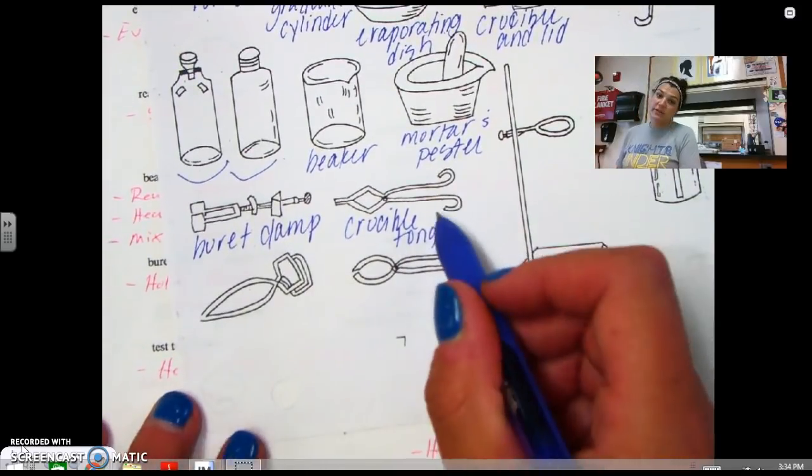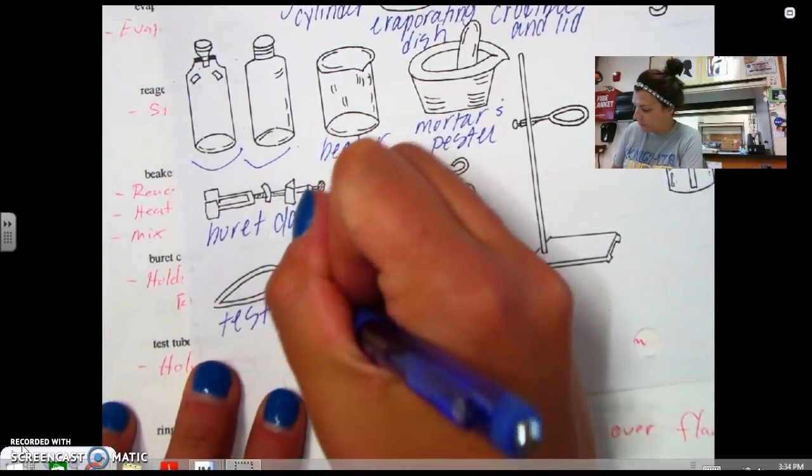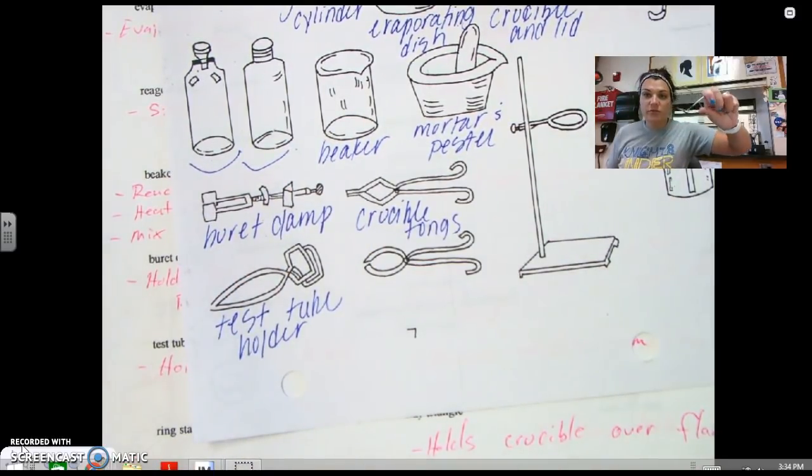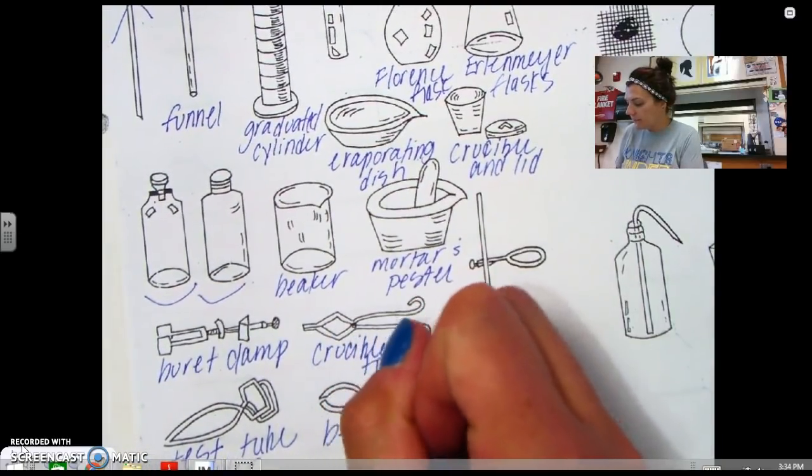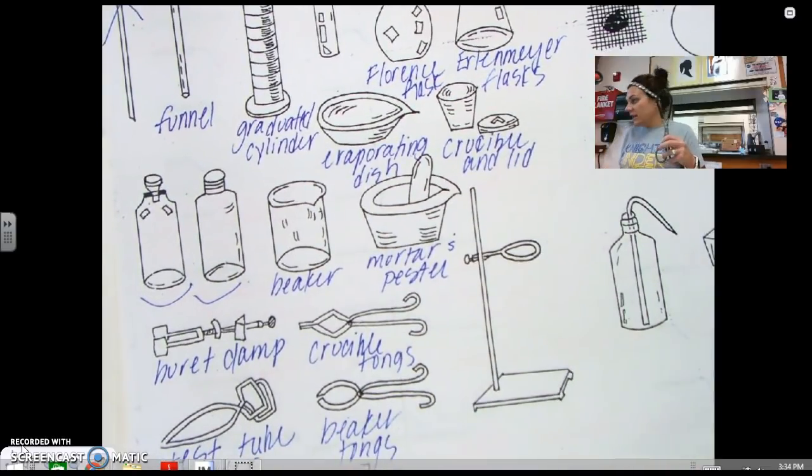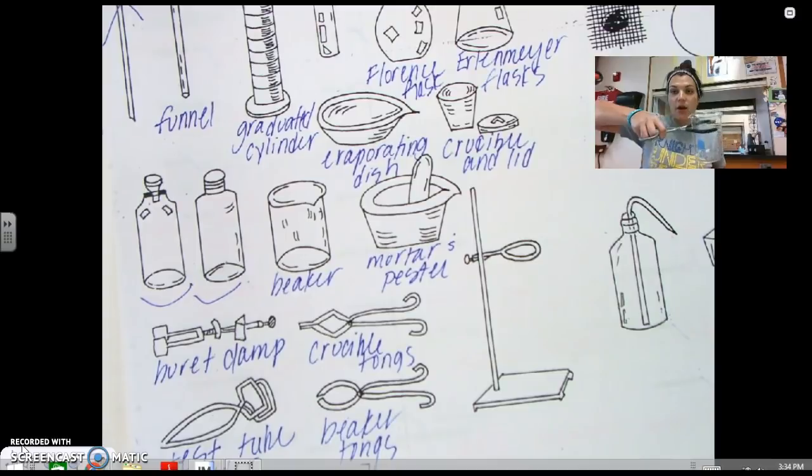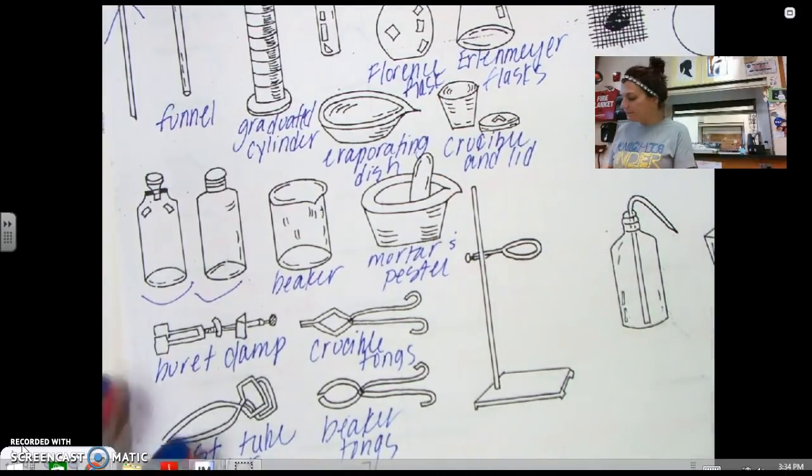The next one, I bet you could figure this out, especially if you were just talking about crucible tongs. This is a test tube holder. And obviously a test tube holder is going to hold test tubes. I hold test tubes. So you can write that down. And then the next one is a beaker tong. And same thing here. You'll notice that these aren't just like regular tongs because we need them to be able to go like this and hold our beaker. And again, remember we can heat things up in our beaker. So we need something to take it away from the heat so we ourselves don't get hurt. So you can go ahead and write, hold beakers.